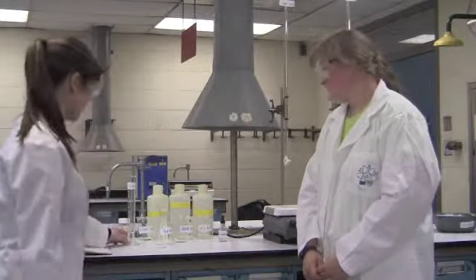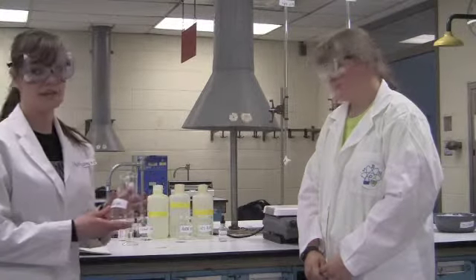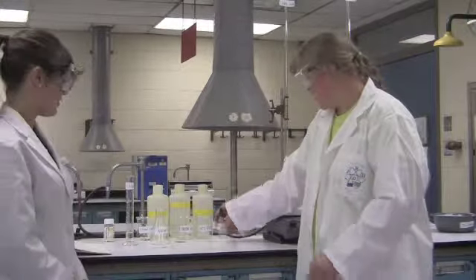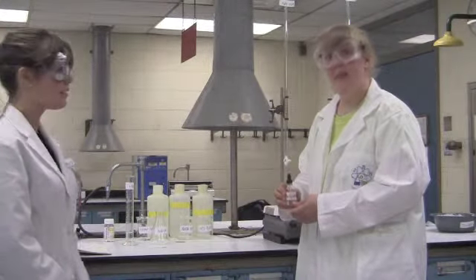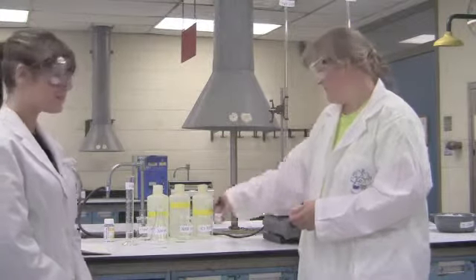Okay, to begin, we gathered all our supplies. We have our ethanol, which is 100% concentrated. We have our Erlenmeyer flask for our analyte. We have our aspirin. And our indicator, phenolphthalein, which will turn from colorless to a pink, and then when we use the hydrochloric acid, it will turn from a pink to a cloudy white.